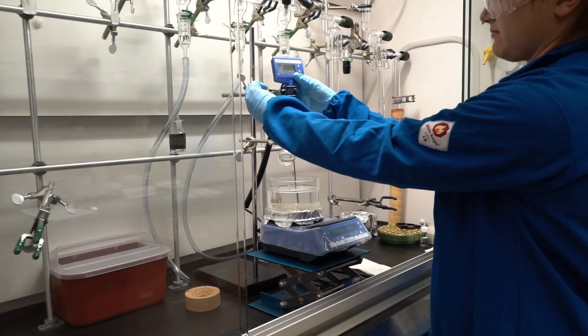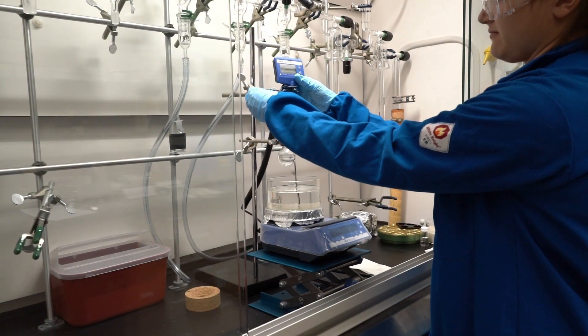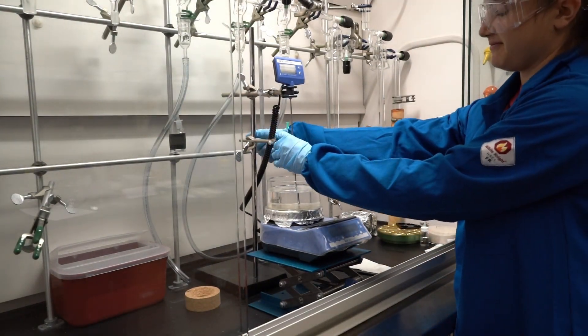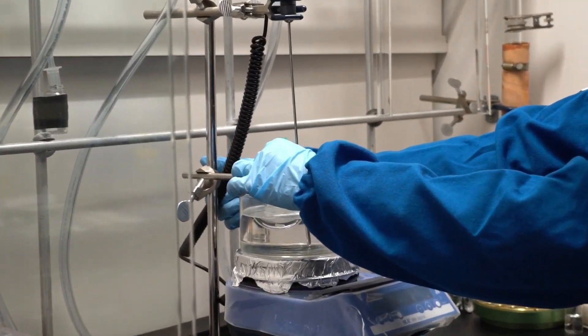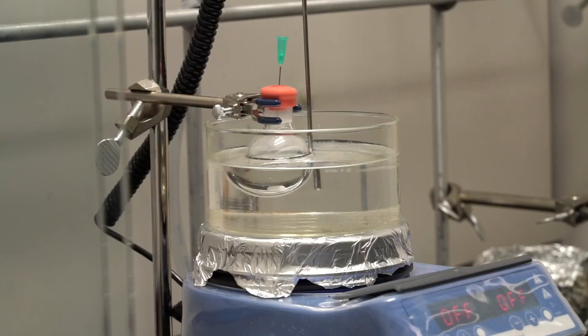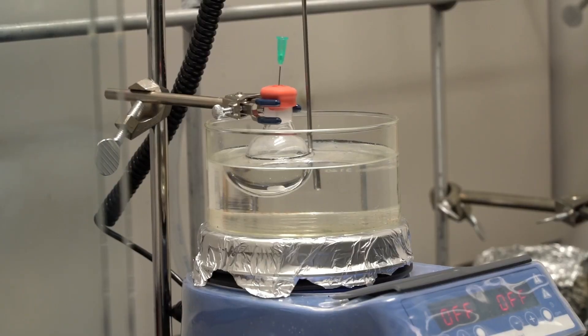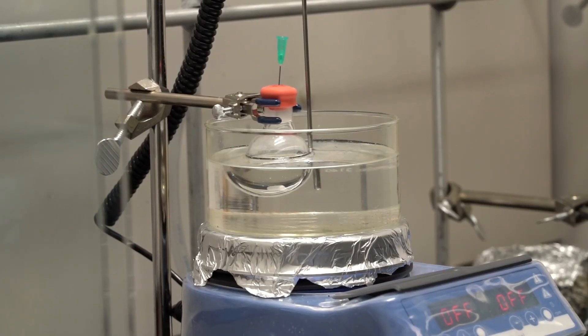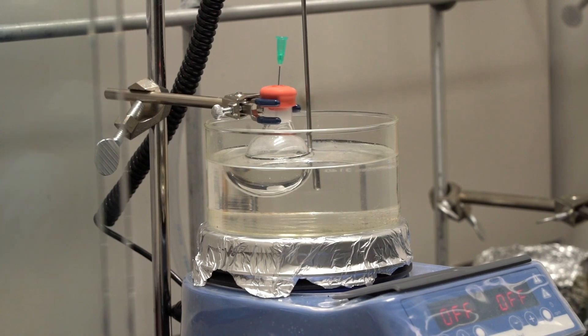Adjust the height of the clamps and the lab jack to submerge both the flask and thermometer. The thermometer tip should be at the same vertical level as your reaction flask, or at least as close as possible, to ensure an accurate temperature reading.